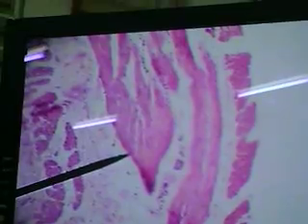In fact, this is what? Must be just going in now to the lower third of the esophagus. Yes, you have a couple of little glands here, nothing much. We're merely just about going into the lower third of the esophagus because this is all smooth muscle. Alright? We are all smooth muscle here.